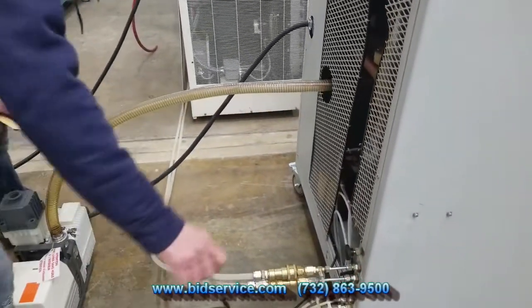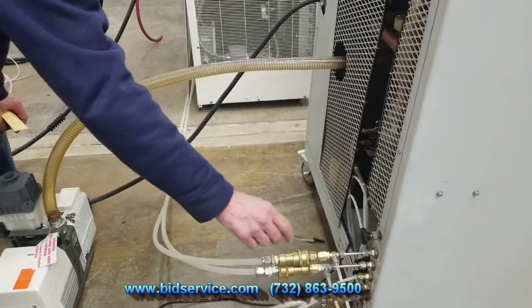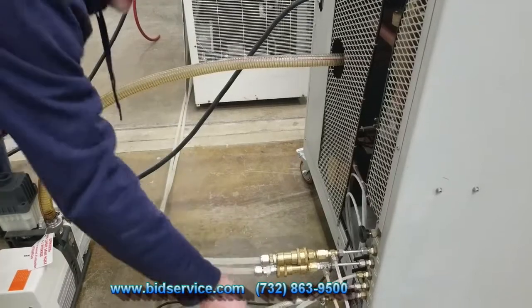And finally we do have air — about 40 to 60 psi of air coming in down here.